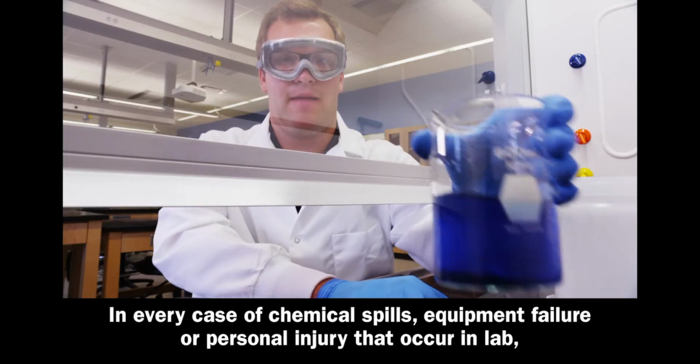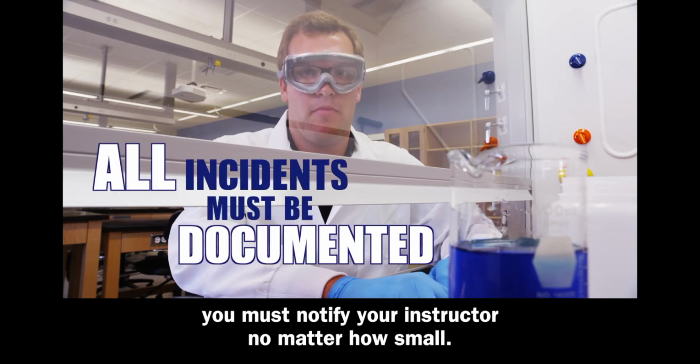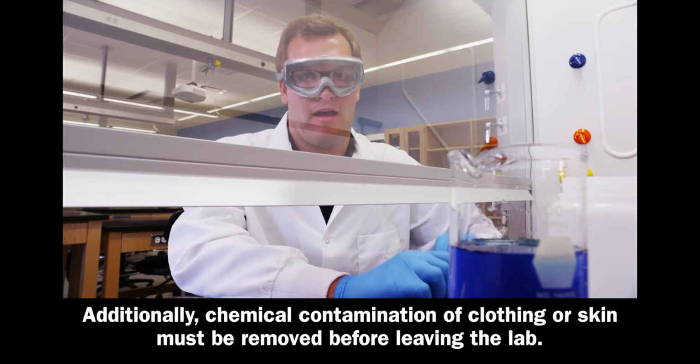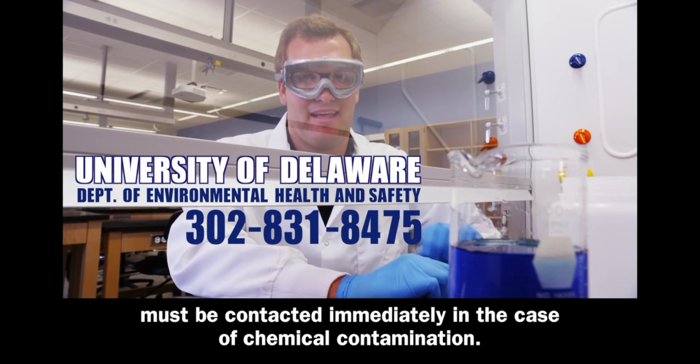In every case of chemical spills, equipment failure, or personal injury that occur in lab, you must notify your instructor, no matter how small. The incident must be documented by your lab instructor, even if it is not life-threatening. Additionally, chemical contamination to clothing or skin must be removed before leaving the lab. The University of Delaware Department of Environmental Health and Safety must be contacted immediately in the case of chemical contamination.